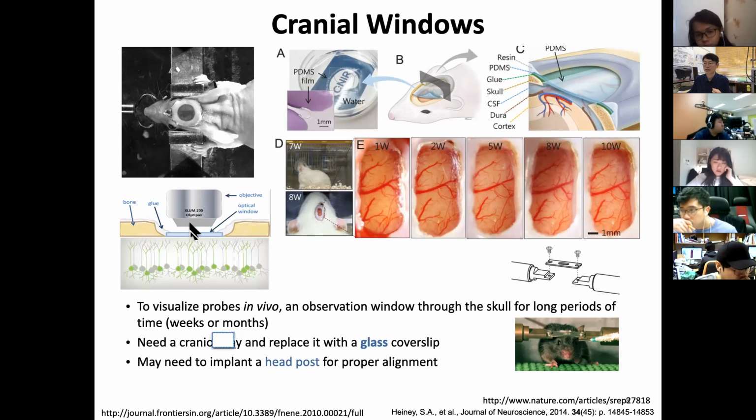So let's look at the bottom figure. Sorry, I updated this slide. I put it in Basecamp. So you see there's a microscope objective. Those who have used a microscope with this 20x, pretty high magnification, will find the working distance is actually not very long, only 1-2 millimeters away.